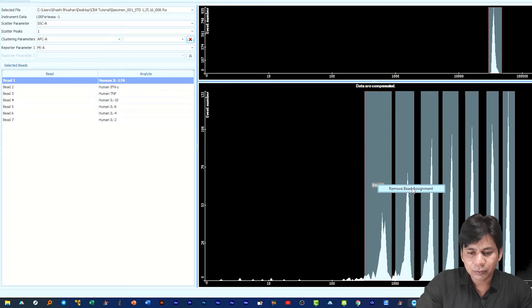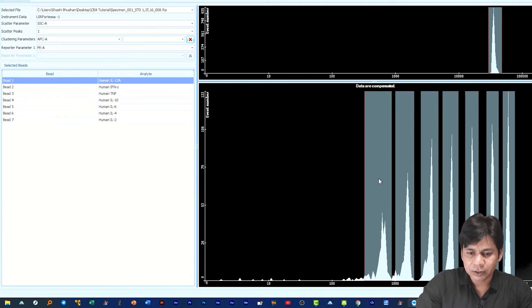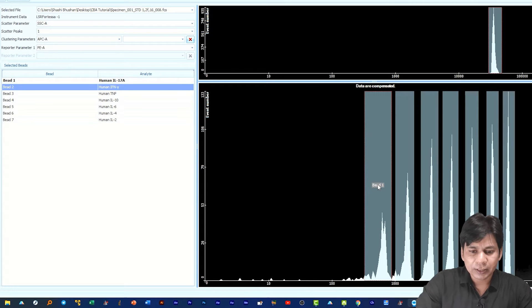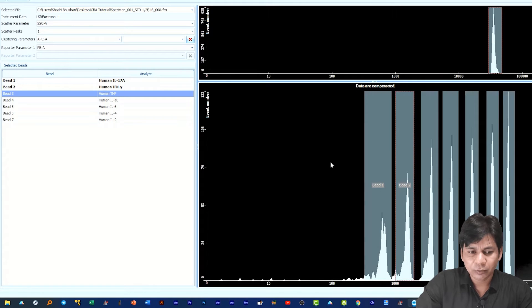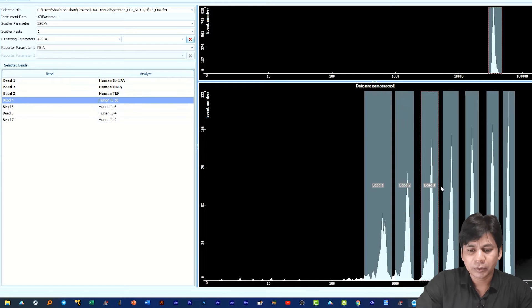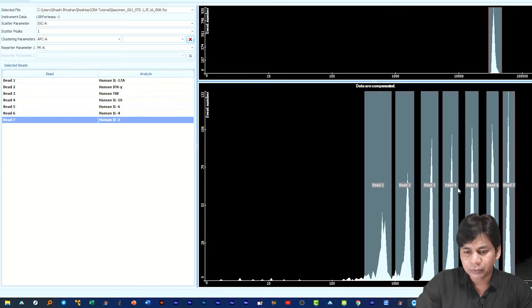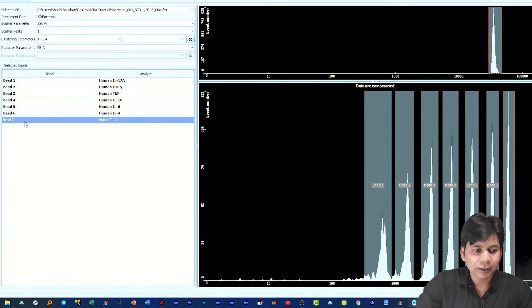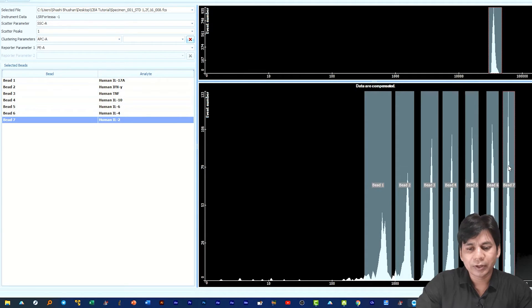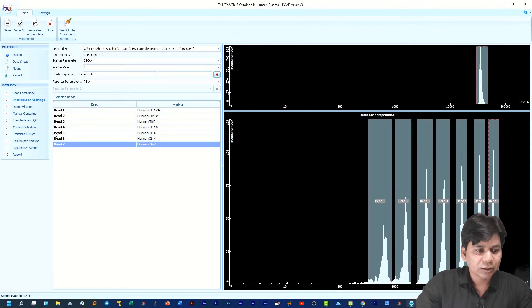If you want to remove an assignment, just right-click and select 'Remove Assignment.' For assigning beads, you can also double-click on the cluster and it will automatically assign with the bead name. For the second bead, just click on it and then double-click on the second cluster — it will assign automatically. With the third bead selected, double-click on the third cluster and it will assign again. By this method you can assign all bead clusters. If you want to remove any assignment, right-click and select Remove Assignment, then select the bead and double-click the cluster.